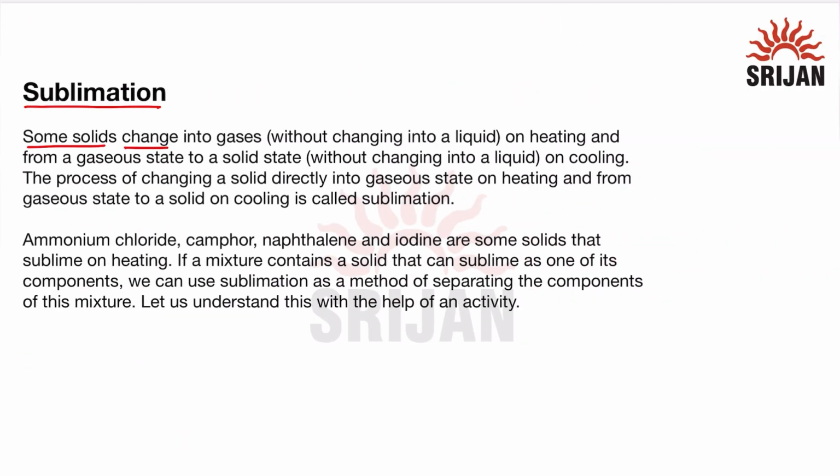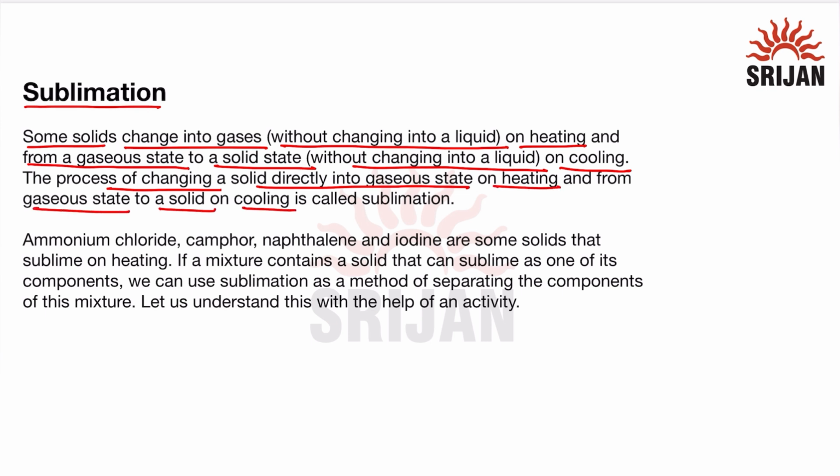Now the next method is sublimation. Some solids change into gases directly without changing into a liquid on heating, and from a gaseous state to a solid state without changing into liquid on cooling. This process of changing a solid directly into gaseous state on heating and from gaseous state to solid on cooling is known as sublimation.